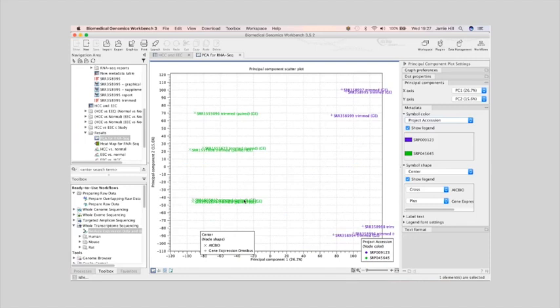So it's these systematic effects of whether they were paired end reads or not. More likely it's about tissue, that one set of these, maybe all the green ones, are liver, and all of the purple ones aren't. But that's the most important difference between the data types. The second most important difference, along this second principal component, separates the normal samples from the tumor samples. So what I'm interested in doing is comparing these HCC samples in green here with these EEC tumor samples in blue. But actually the difference between those two is a bit confounded by the fact that even the normals are different in these two cases.